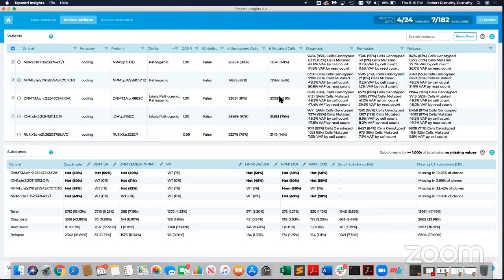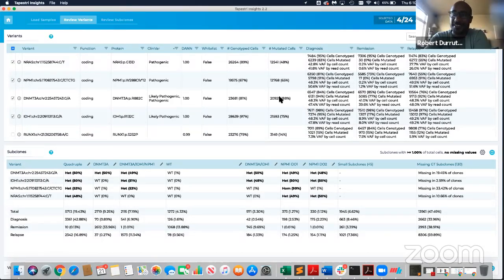This video is great. Is there a guide also that explains how you select variants? That's also a very good question. At this point, there is not. We have a glossary on our knowledge base that illustrates some of the key features and what they mean.